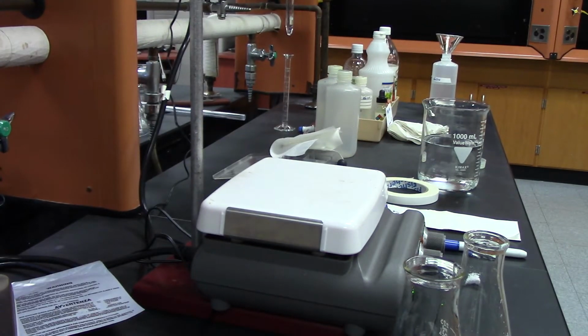All right, for the second part of this experiment, after we do our calculations, we'll know the concentration of the sodium hydroxide that's in the burette. But right now, we're not going to worry about that because we can figure it out. What we know is the concentration of our sodium hydroxide. Now we're going to try to figure out the concentration of our vinegar, the acetic acid in our vinegar.